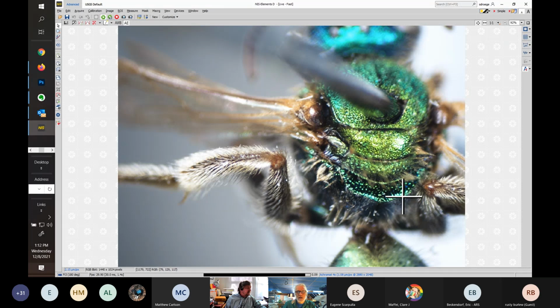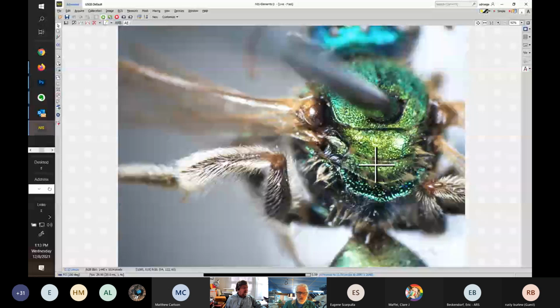In the previous specimen, the edge was not very crisp; it was a little bit rounded over. Again, sorry for the difficulty in seeing these things sometimes. And that propodeal triangle midsection length was much closer to the length of the scutellum than the metanotum. Here you can see in this one, it's pretty skinny, about the same length. If you look at a lot of keys for gratiosa, this could fit that. This is what we'll talk about in terms of gratiosa versus aurata, because this is about the same length as the metanotum, and in gratiosa, theoretically, it's the same or less. You can see a nice crisp line at the edge where it becomes the rear face, and lots of striations in this particular specimen.